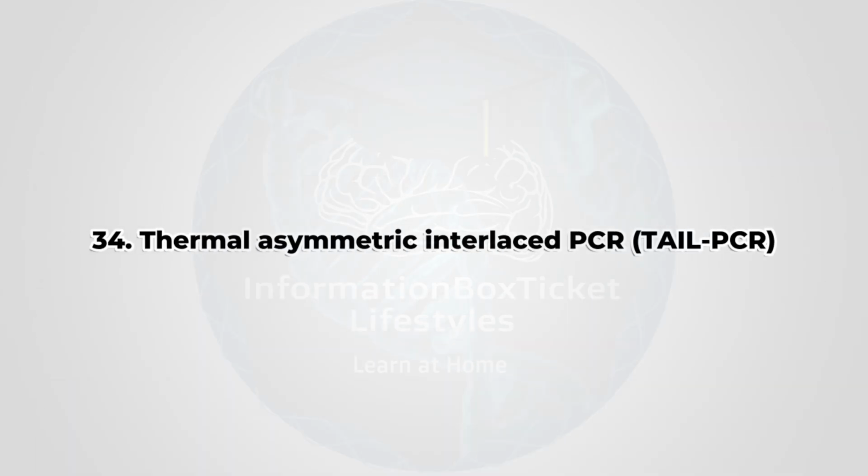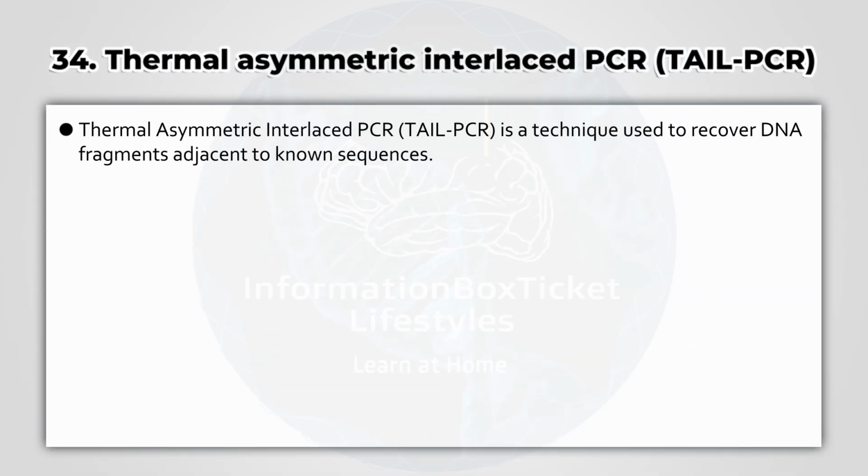34. Thermal asymmetric interlaced PCR, TAIL-PCR. Thermal asymmetric interlaced PCR, TAIL-PCR, is a technique used to recover DNA fragments adjacent to known sequences.